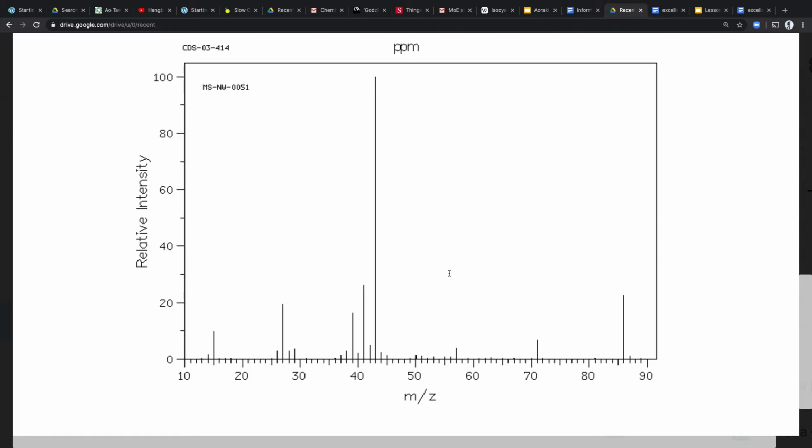In the report, I'm expecting you, for excellence, to propose structures for 2 fragments. So the base peak can be 1, and then the methyl group is kind of a cheat option because it's pretty easy. But if you want to be more challenged, maybe justify one of the other peaks. In this case, the base peak has 2 fragments associated with it. So could I cheat again and just do the methyl? No, you've got to talk about the 2 peaks. Can we cheat the molecular ion?